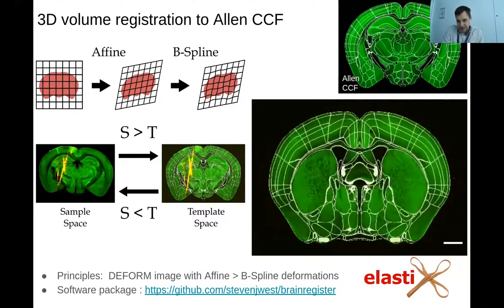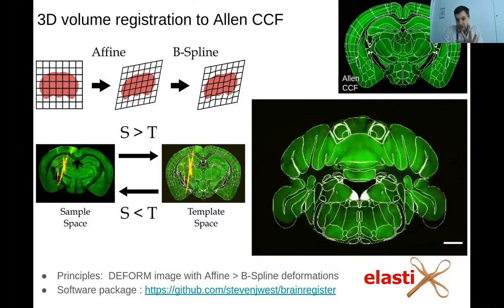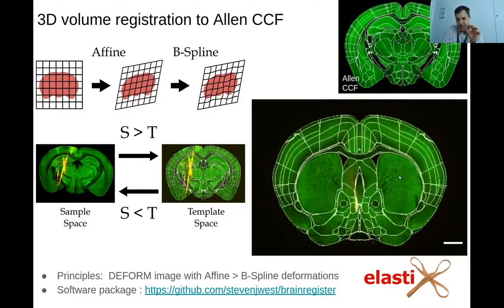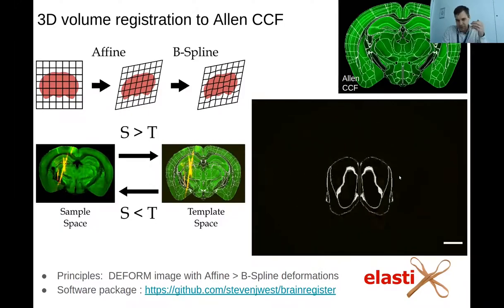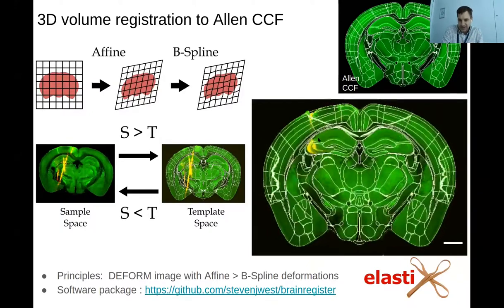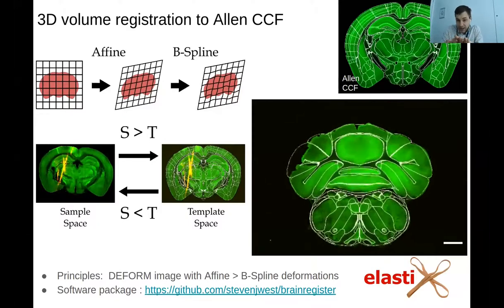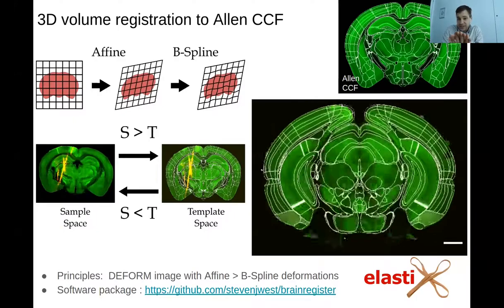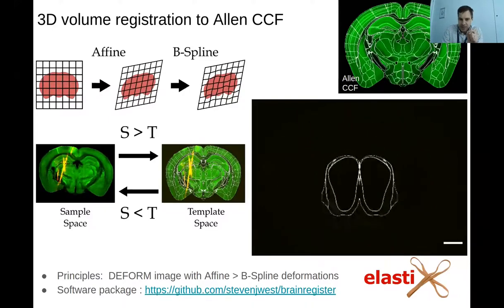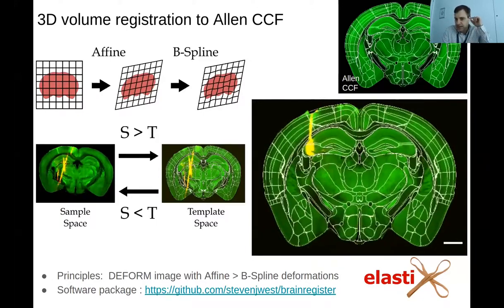An example of that is shown here on the right-hand side of this 3D volume as we fly through. This has been registered using the autofluorescent green data, and you can see the atlas outlines are shown in white. This transformation has then been used to deform also the red CMDII tracks as well. So what you end up with is your actual histology data now well-aligned and overlaying the atlas — essentially you've moved your histology into the atlas space. This means you can now pick coordinates in your histology data and they will correspond to points within the Allen atlas space.